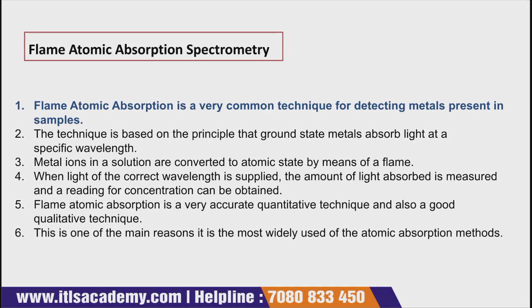So what do you understand by flame atomic absorption spectrometry, or which type of analytical technique is it?